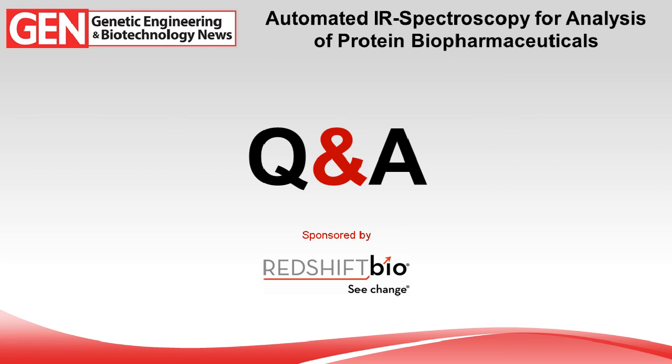All right, thank you, Lucy. We have another question for Dave. This comes from Vivek at Lonza, who wants to know, what is the impact of the presence of detergents in the protein sample during analysis by MMS?